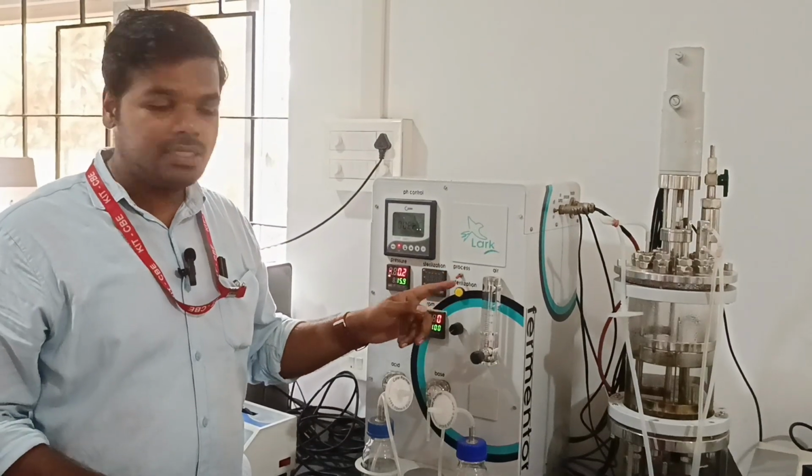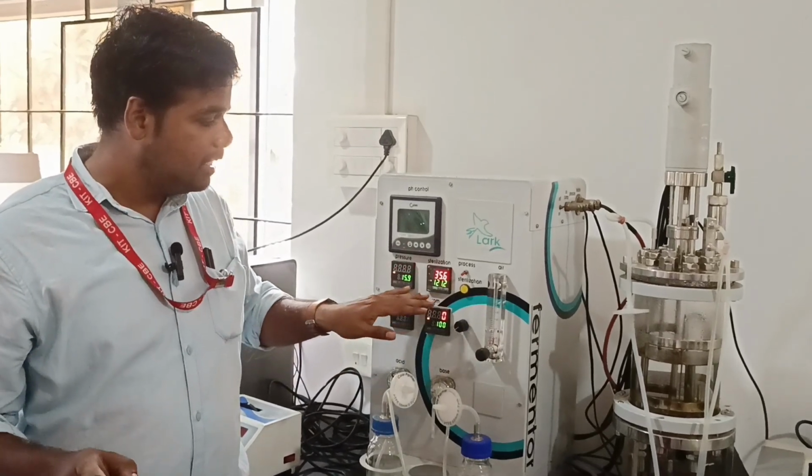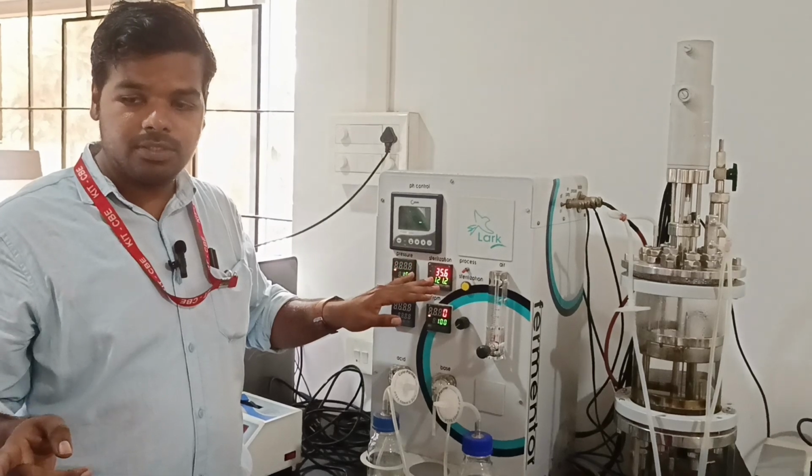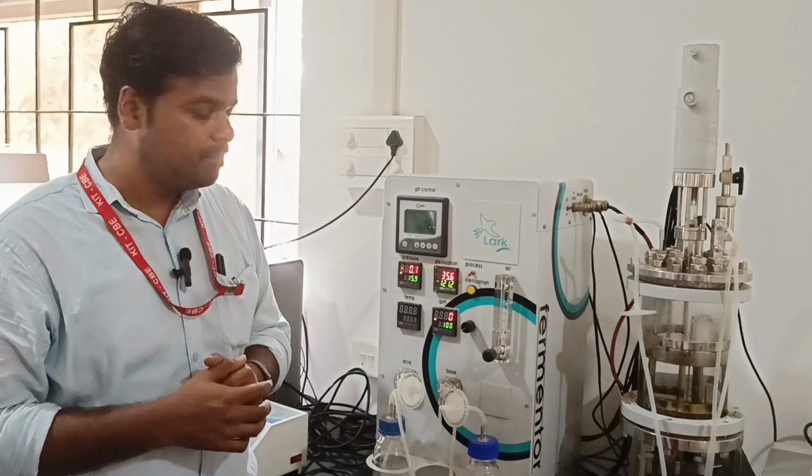Just switch on the sterilization button. So note down the temperature now, for 0 minutes. What is the temperature now? 35.6.